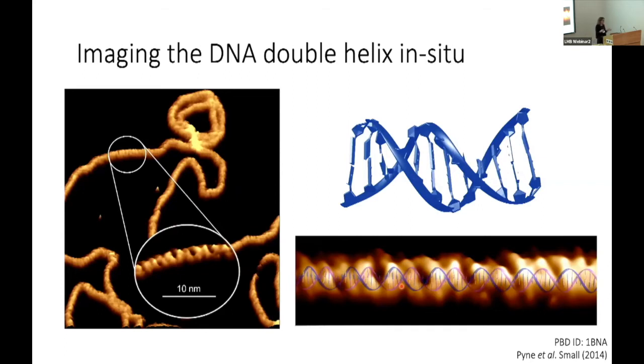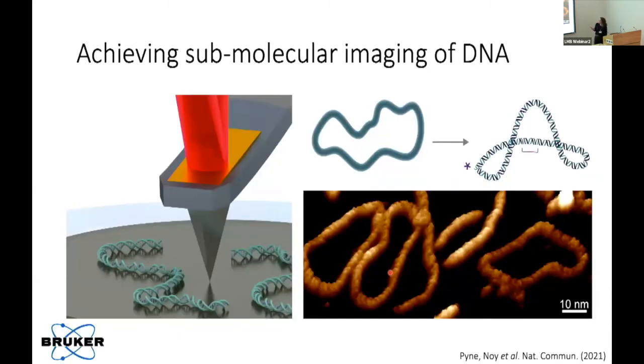We have an issue with our technique where we're physically probing it and we get a thing called convolution. In an AFM, like the surfaces, we tend to ignore that. We showed that we can reconstruct that out, but it's quite computationally expensive and we tend not to do it. But one of the artifacts that this gives is that it actually changes the chirality of the helix. So this is quite vertical in shape compared to the chiral angle here, and that's an artifact of this broadening. But we can again reconstruct that out and we get the correct helical angle, the correct width, the correct height. So everything matches nicely, but we see this variation. So what can we use the fact that we can see this structure to find out? And how did we get there?